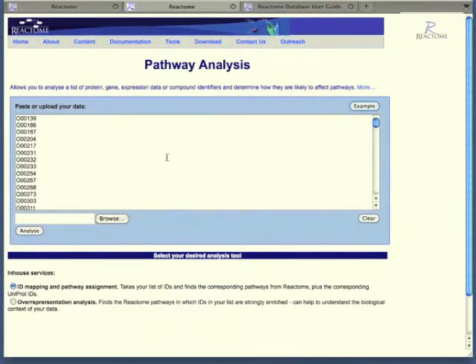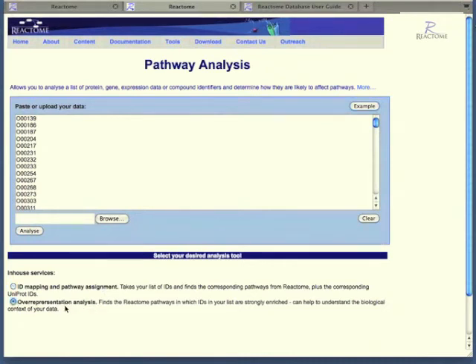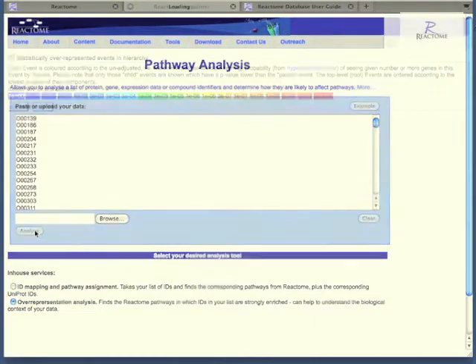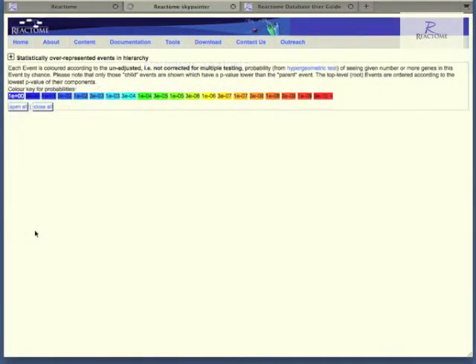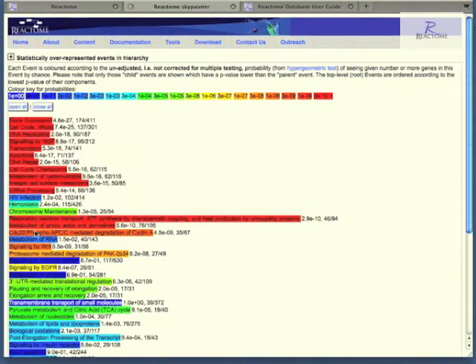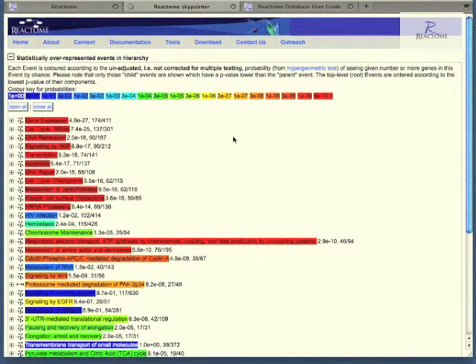Returning to the pathway analysis page, I'm going to load the example data. And rather than ID mapping and pathway assignment, I'm going to look at over-representation analysis, which I'll begin by clicking the analyze button. The analysis returns a list of pathways in which your IDs are strongly enriched.